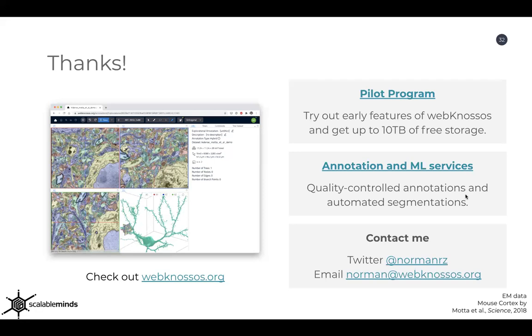So hi, I'm Jared. I'm from the EBI. So I'm living in the world of archive. So one of the things we have started to archive is volume data. So I'm still trying to wrap my head around things. So I'm trying to understand if we mean the same thing by annotation. So for me, annotation means taking a segment and attaching a label to it that has biological meaning.